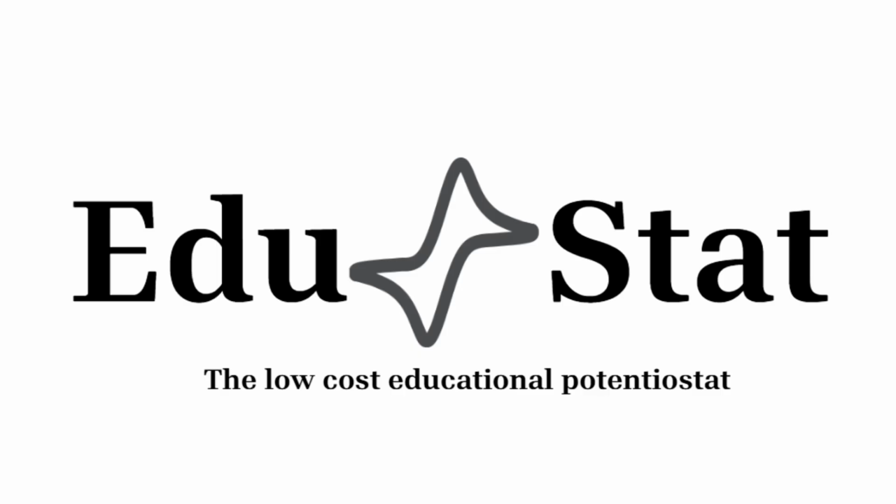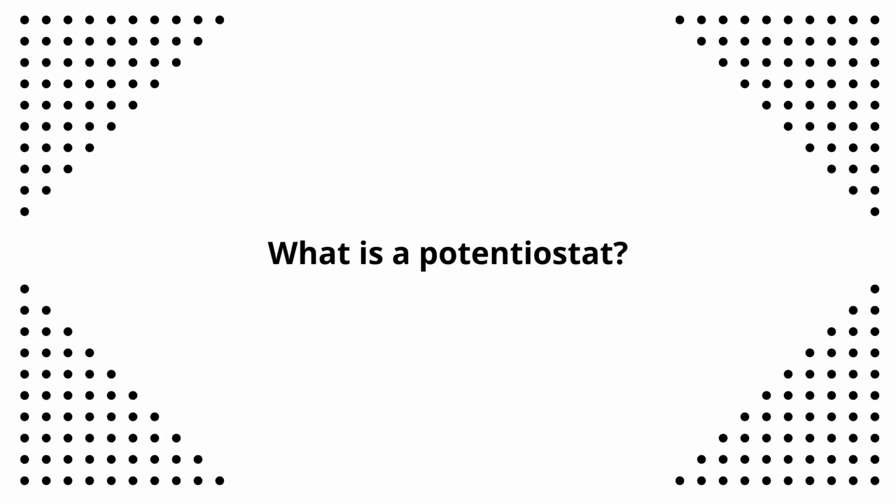As you see in the video, we aim to significantly reduce the cost of a commercial potentiostat, which can exceed 50,000 Brazilian reais, making it viable for students and researchers who would otherwise not have the opportunity to use it during their undergraduate studies. But first, what is a potentiostat?